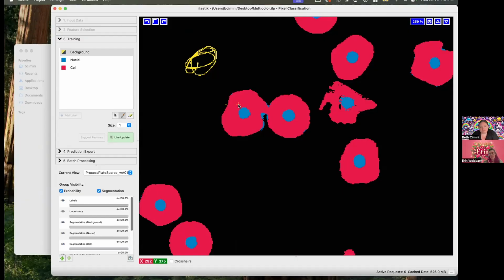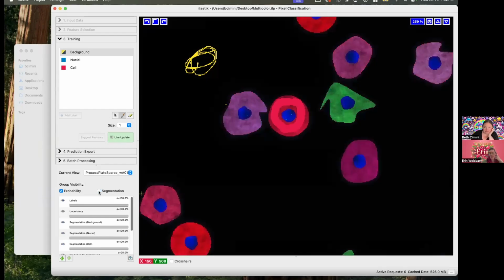And then even within the CellProfiler pipeline, you can do the things you're perhaps familiar with around object identification. We could fill the holes or smooth it out, or add or subtract some number of pixels to the edge of the objects.